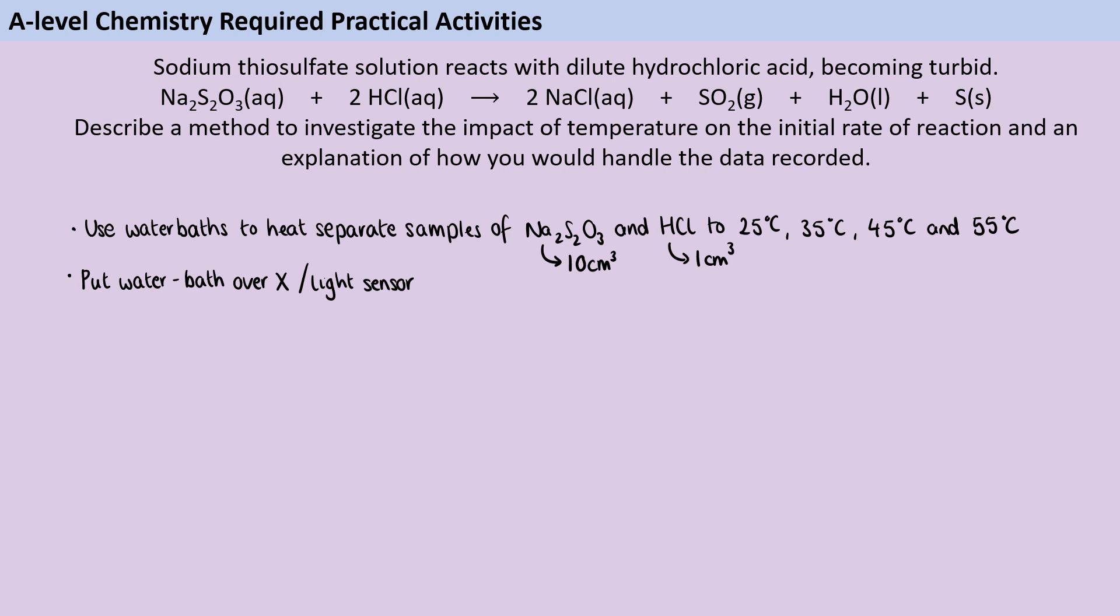Then of course we need to actually add our reactants together so we're going to add our first sample of hydrochloric acid to the sodium thiosulfate and of course as we do that it's important that we say that we will start the timer.